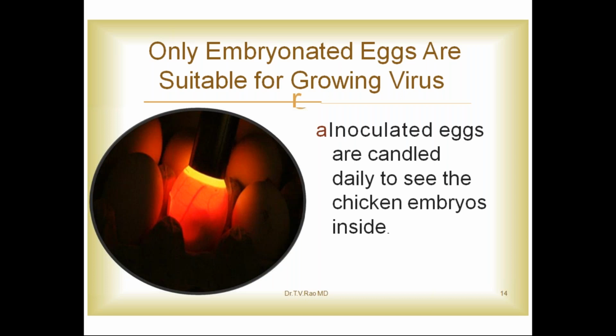Suppose the embryo is moving, then it is live. Suppose the embryo is not moving, blood vessels are not good, and there is no eye-like structure present. That indicates that the embryo is dead. That is why we have to do candling daily to see the embryos inside.